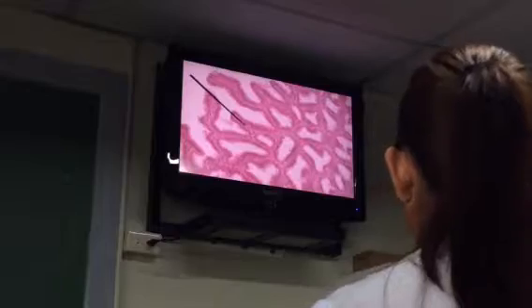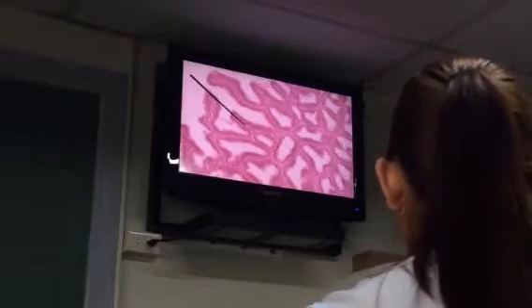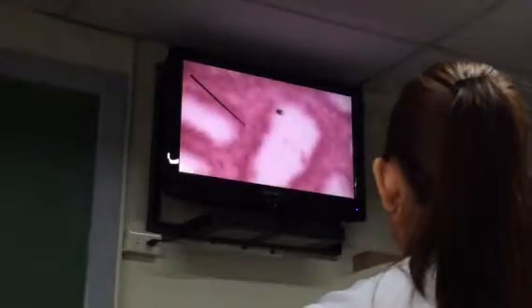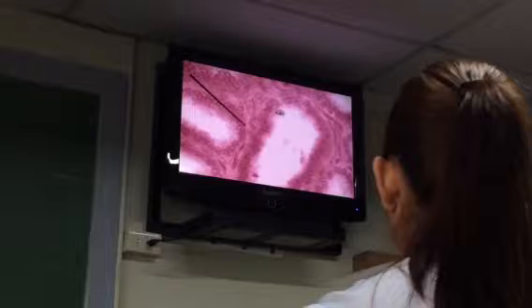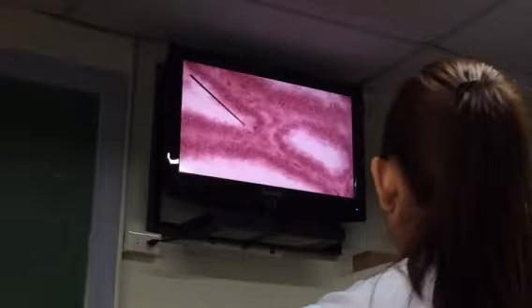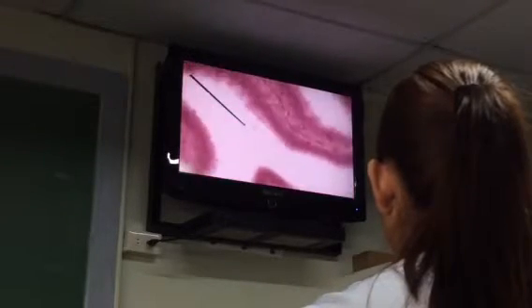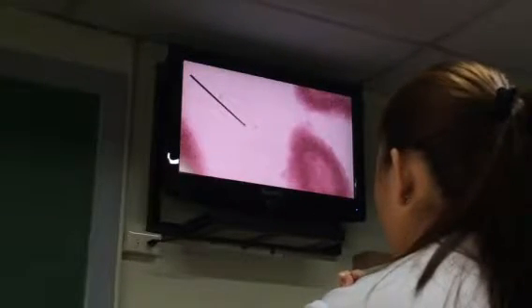Now, if you examine the mucosa of these infoldings, again, you'll see it's lined by pseudostratified columnar epithelium. Pseudostratified columnar. Okay? Now, do not forget that this is a gland. It has secretions, mainly fructose, for the nutrition of your sperm cells while they are waiting in the vas deferens, because the vas deferens is just beside the seminal vesicle.